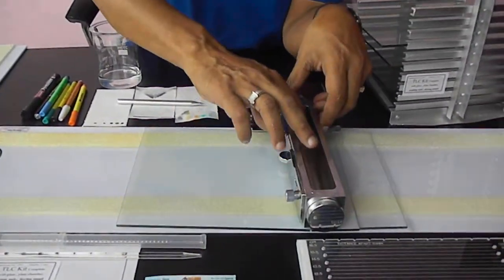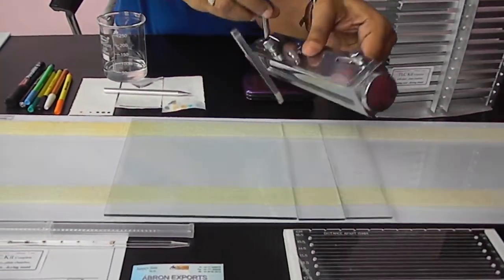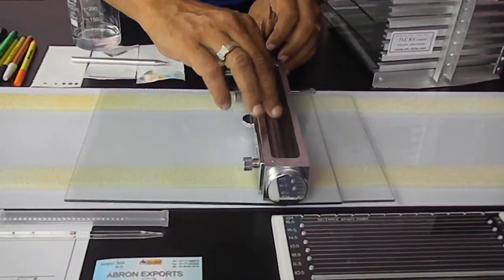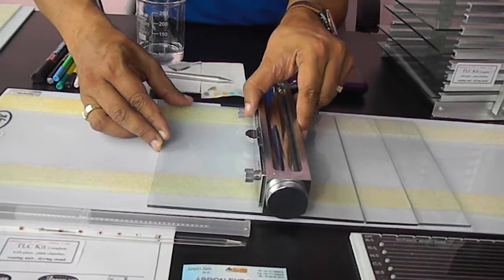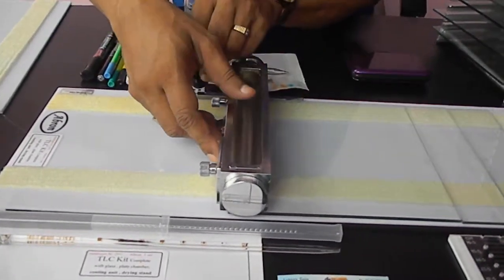So first of all, you prepare the solution, keep it inside this. This can move, and the chamber portion opens on the bottom. You can adjust it. First of all, you put the solution, the coating chemical, in this, make it upside down and manually move it so that 1 mm of coating is done, and then you close it again.